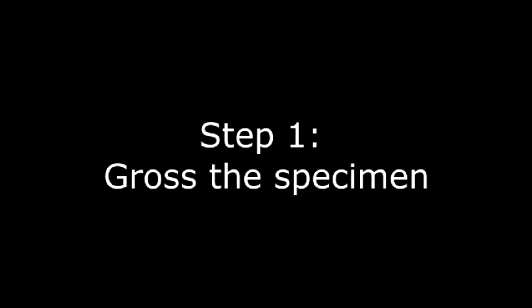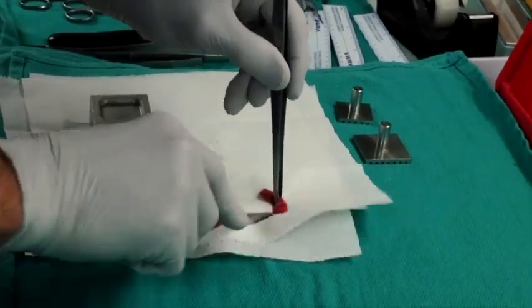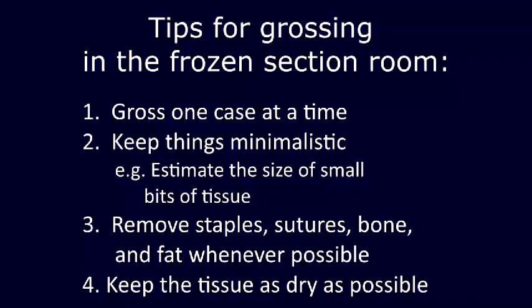Now we're going to talk about freezing the specimen and preparing the block for cutting. We're going to cut a piece of tissue here — this is mussel.